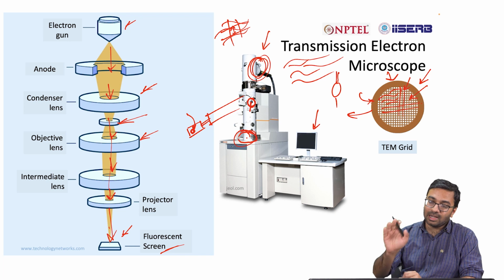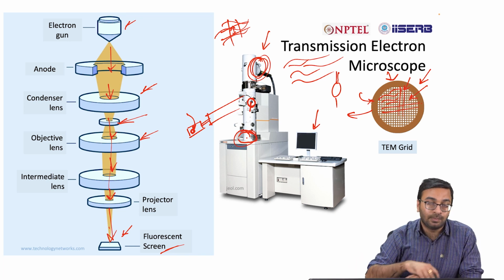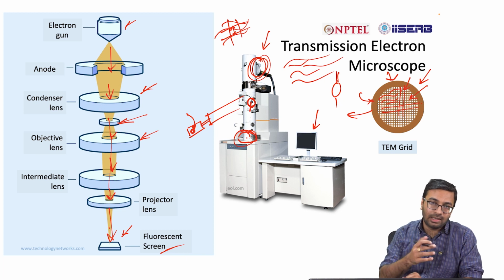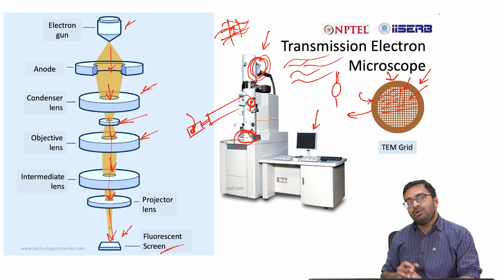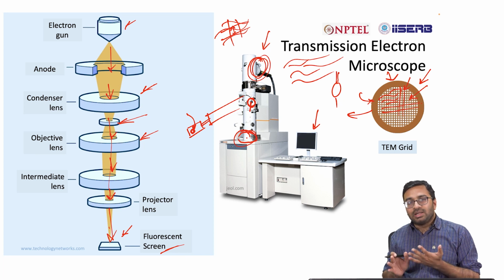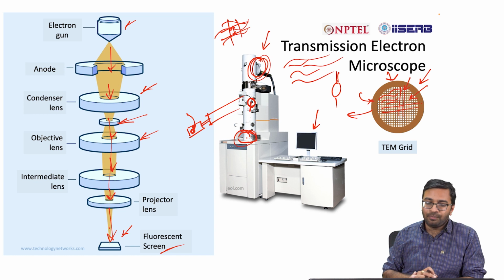You will find transmission electron microscopes with EDS as well, similar to what you have seen in scanning electron microscope, and then you can also do elemental studies. What are the materials present on that particular sample? You can study that as well.